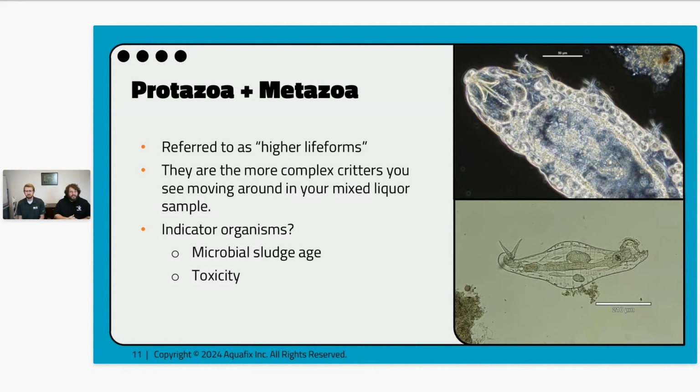They will eat some of the dead bacteria and some of the dying bacteria, but just the way that the crawling ciliates duplicate based on the way that your bacteria are duplicating, you can never have so many crawling ciliates that they're consuming your sludge to a detrimental extent. We can look at some of these to give us signs of toxicity.